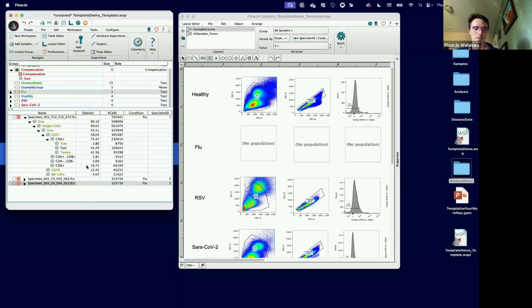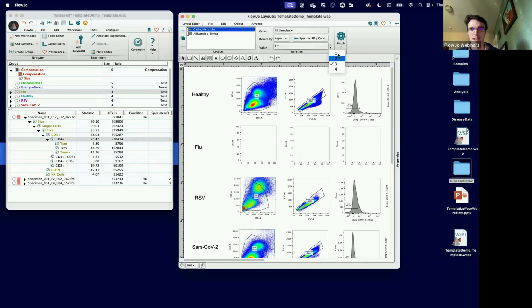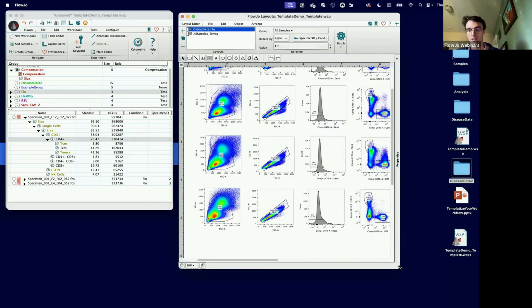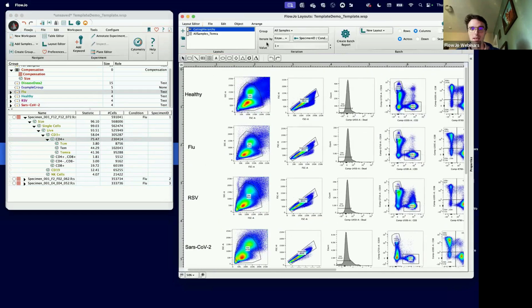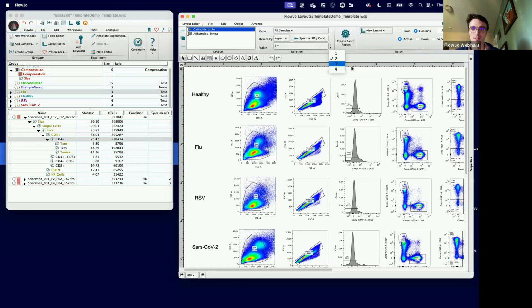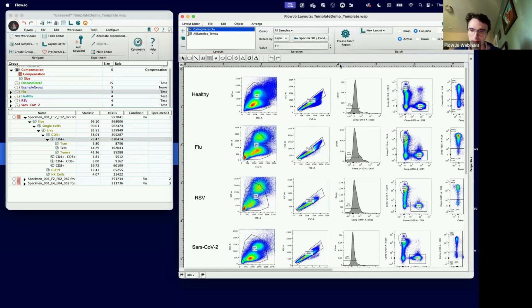Okay, this last one I only included three, but that's fine. It should be able to handle it. And so you can see over here now, it's just taking a second to reload. Sometimes it reloads faster if I just toggle between these different values, but you can see it's now reloaded all the samples based on this keyword combination. And so sample value of 1, 2, 3, etc.